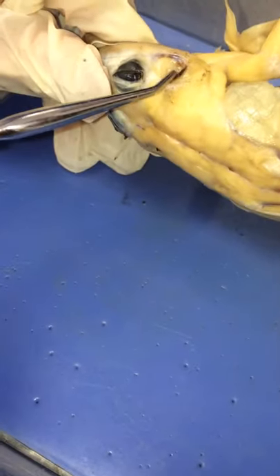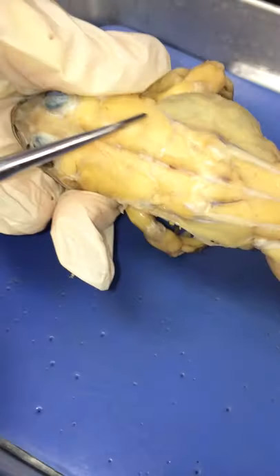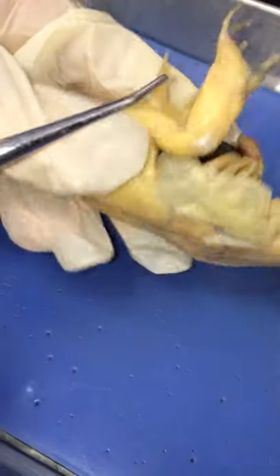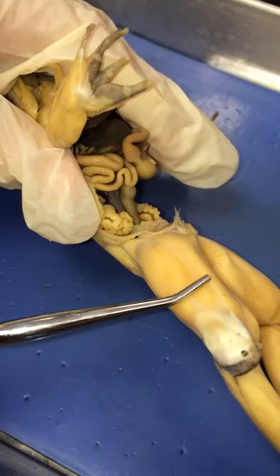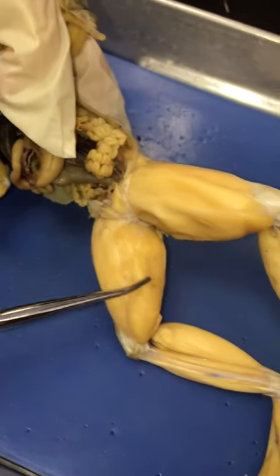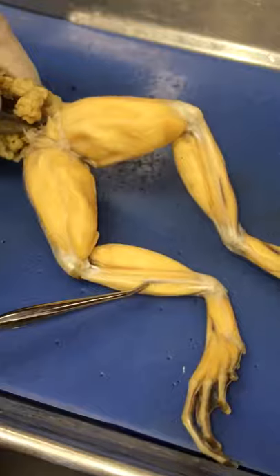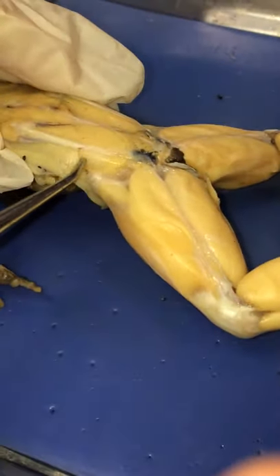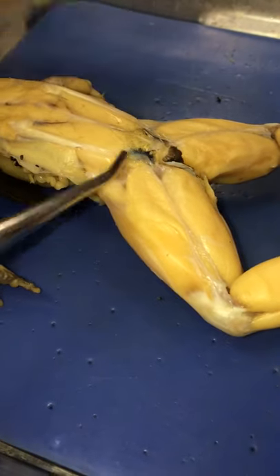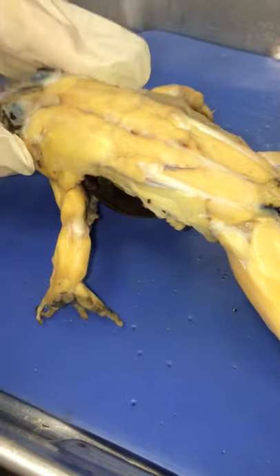We've got the tympanic membrane, and the tongue is obviously in the mouth. Let's do muscles though — latissimus dorsi across the back, bicep, tricep. In the leg it is the opposite, so tricep femoris, bicep femoris. Here's the gastrocnemius, tibialis anterior, and then these small structures right here are the gluteus maximus and latissimus dorsi.